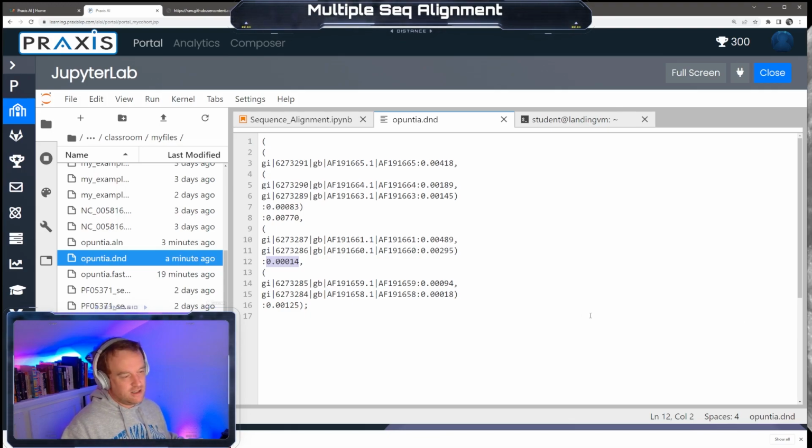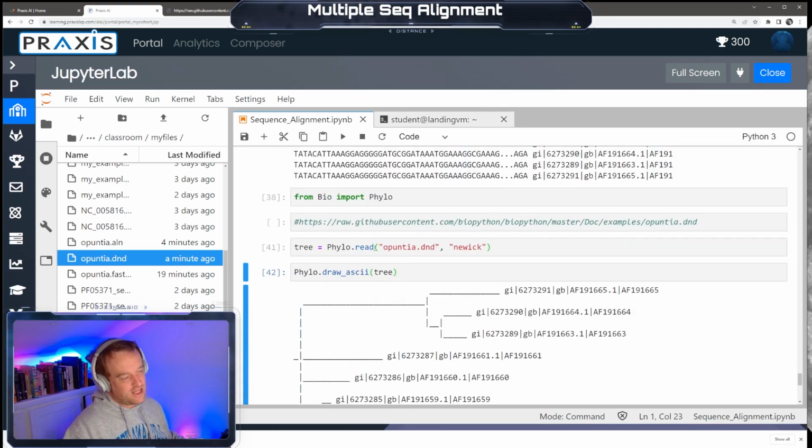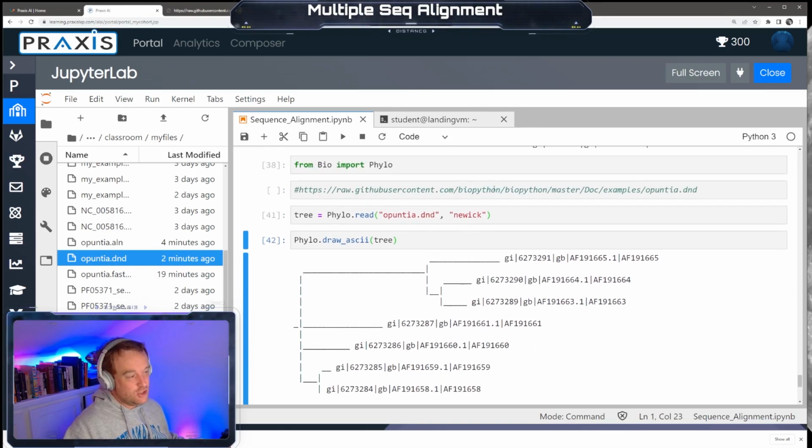So once we get into the phylogeny stuff, we'll go over this a little bit more, of how these values are created. But what you can do is you can plot these, and as you can see which sequences. You don't have annotations like if this was human, chimpanzee, gorilla, macaque, spider monkey, or something like that. So we're most closely related to chimps, and then to gorillas, and then to these other species. But yeah, for phylogeny, it's really easy to do in Python using these Newick files.